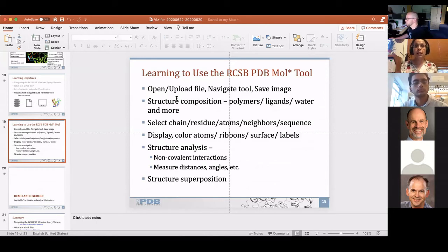We will try to complete at least the initial piece of exploration of the main apo structure today, and you're welcome to continue working on it later this afternoon or evening. Tomorrow we will continue that exercise. Tomorrow morning we will start off with an introduction to ligand binding to this particular protease. So that'll give you a little more context to what you're seeing when you look at these inhibitor-bound structures.